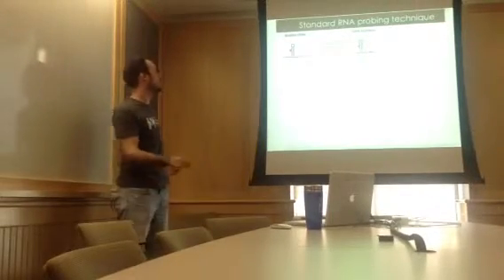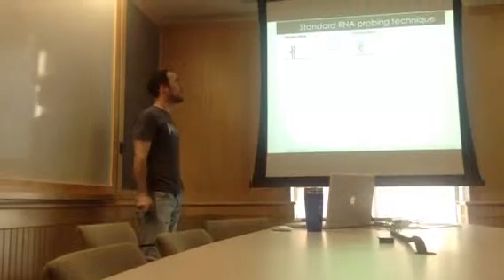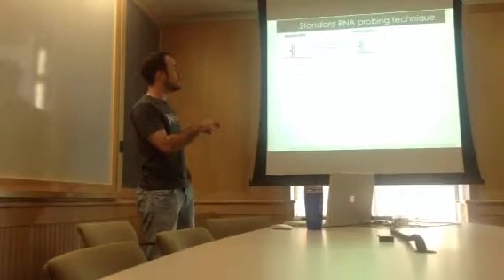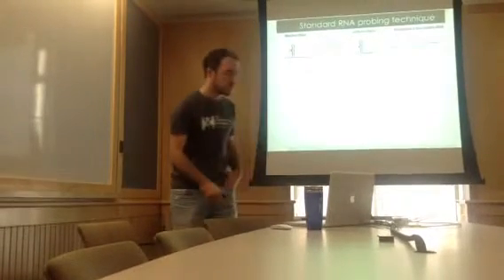have our RNA that is modified, and then by using a specific RT primer, 5' labeled with P32, we can do an RT. The RT will stop at the modification site and produce a cDNA.